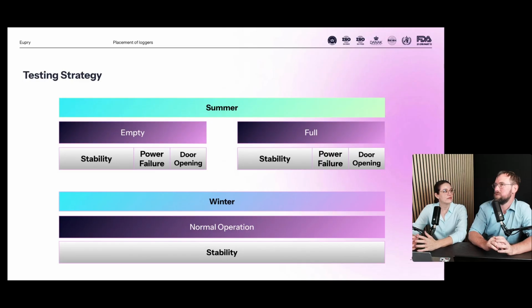Yeah, and how would you simulate if it was a smaller unit, like a fridge or freezer? Then it could also be boxes, like polyester boxes or cardboard boxes or bottles. It depends also on what they're gonna store. So it's really nice to have something that would be close to what you're actually gonna store in that unit, but it could be a large amount of different things.